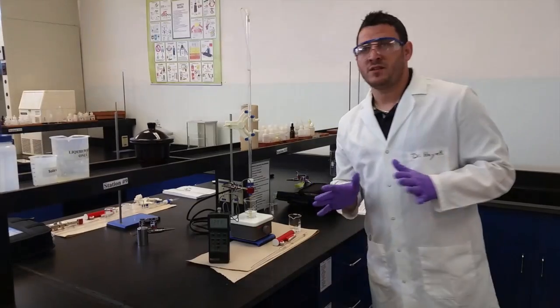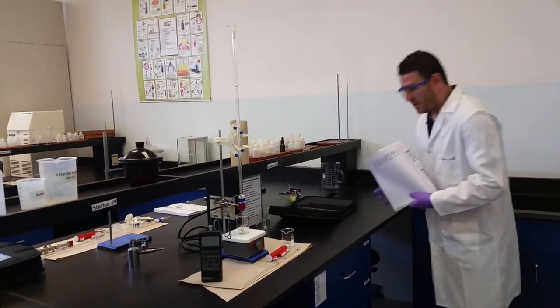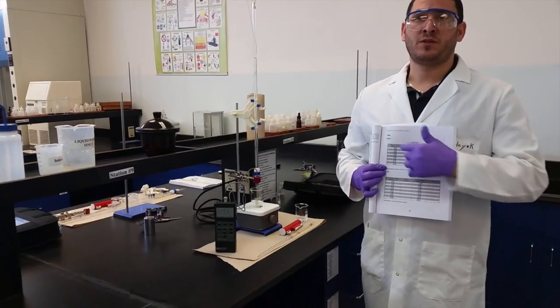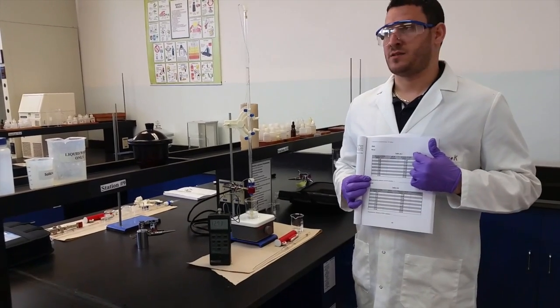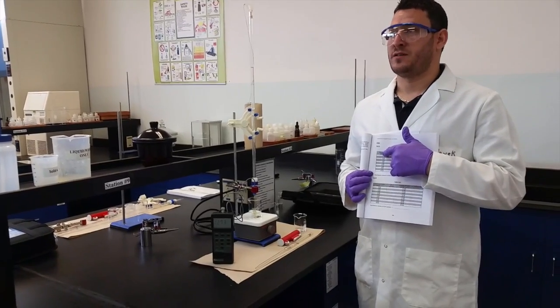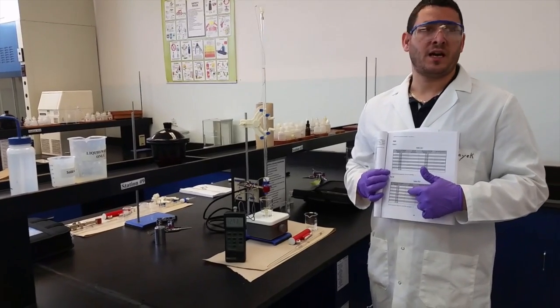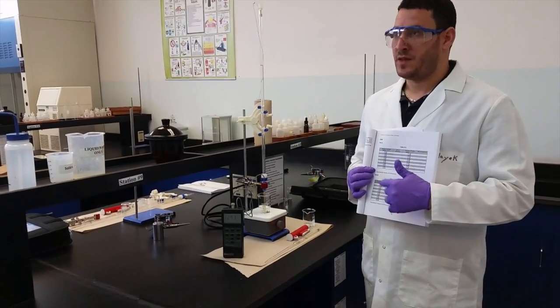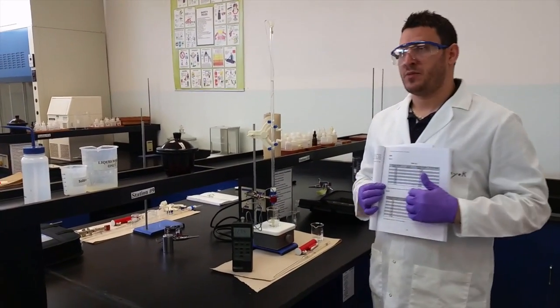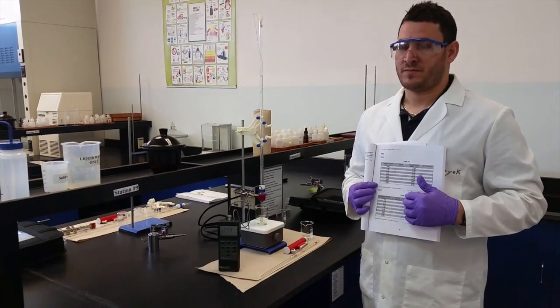Okay? Now taking these values, you fill them in these tables, and later on you will be able to build your acid-base titration curve. You will do the first one for the strong acid, strong base. The second one, weak acid, strong base. Now remember, for the weak acid, you should observe the rapid increase in the pH, right? This is what we call the hump. Okay?